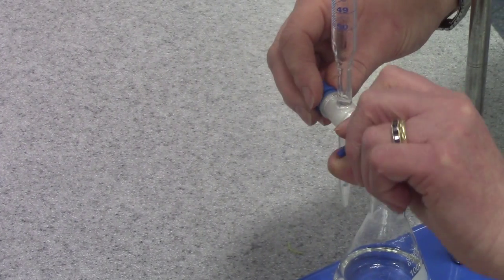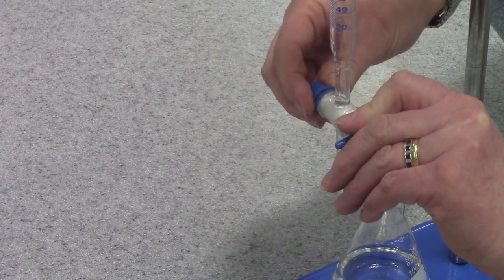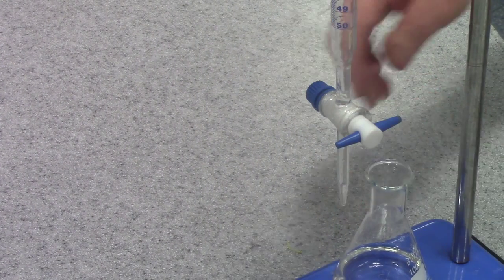It's also got a tap at the bottom which opens and closes, and that allows us to control the flow of the titrant as we add it to the analyte.